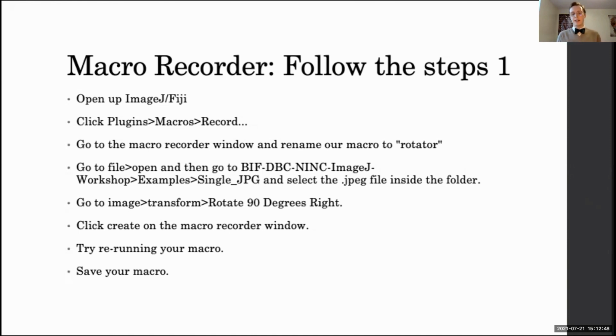So I think I'm going to give it a couple more seconds and then move on. If anyone was struggling with that, you can of course find these notes in the workshop folder, and you can feel free to work through them on your own time.